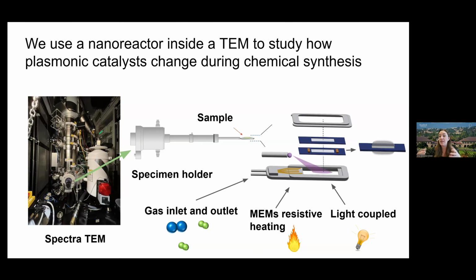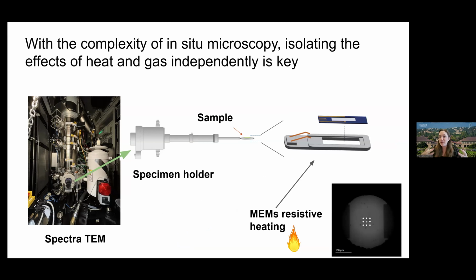However, in situ microscopy is notoriously complex, and so we want to make sure that we're understanding how the system responds to each of these stimuli independently. So for the sake of time, I'll talk about how the systems respond to heat and gas for this talk. We'll save light for another day.